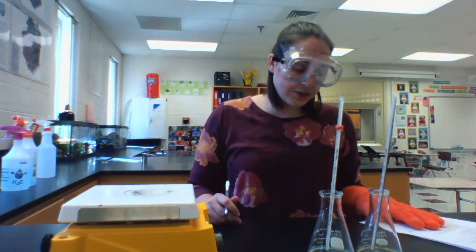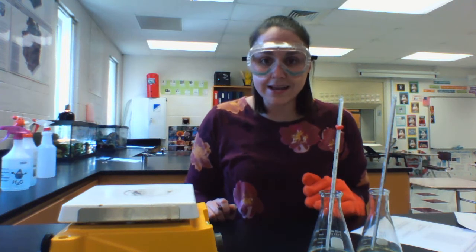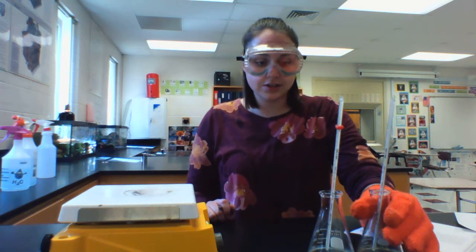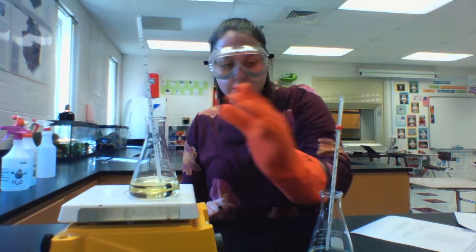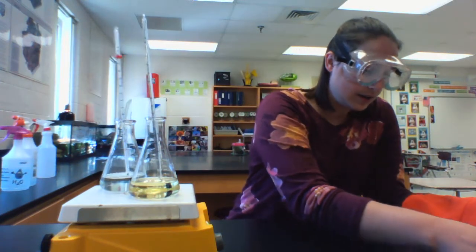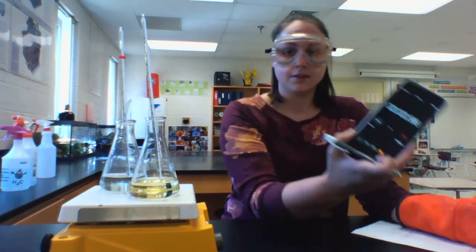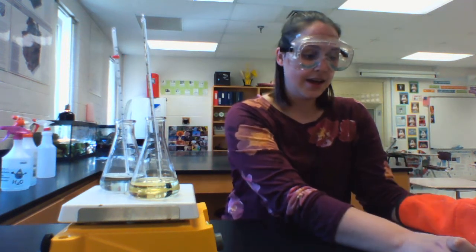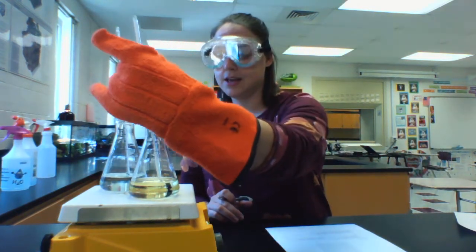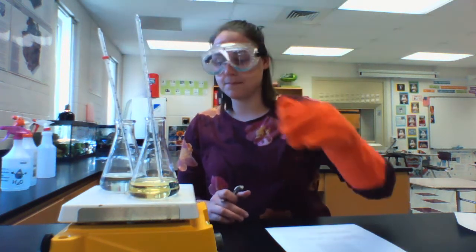I'm going to have them there for 5 minutes, and every 1 minute, I'm going to measure the temperature of my Erlenmeyer flasks. So I'm going to begin. I'm going to set the oil and the water side by side, and I'm going to turn on my stopwatch, which is set and counting. When that gets to 1 minute, I'm going to check the temperature of each of my Erlenmeyer flasks to see how it's changed over the past minute.